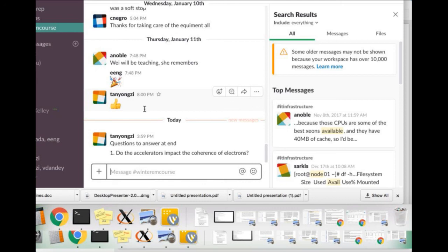Then you've wasted all this additional time and effort to process something so big, but you're not getting there. So you don't have to go crazy and push all the way to the limit from the get-go. That's the biggest advice. Oftentimes when we have users with newer projects, we tell them to do a standard collection with 1 angstrom pixel, and once you hit 4 or 5 angstrom and you're pushing resolution, that's when you start throwing all the bells and whistles at your image collection and your processing. That's where you really want to get fine-tuned.